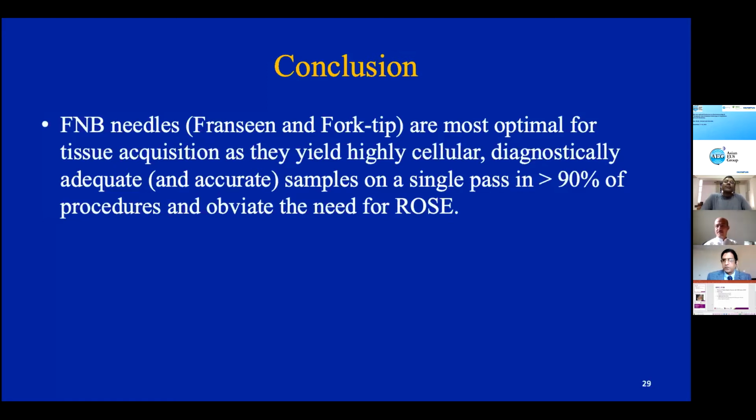But when you're using FNA needles and you're processing it like aspirate, that is when Cytolyt comes into play. There's nothing wrong in putting your 22 gauge FNB samples into Cytolyt, but our pathologists don't prefer it, because if you put it in Cytolyt, they still have to create a cell block by spinning it and so on. But if you put it in formalin, you don't have to do that. You can just go straight for preservation and sectioning.